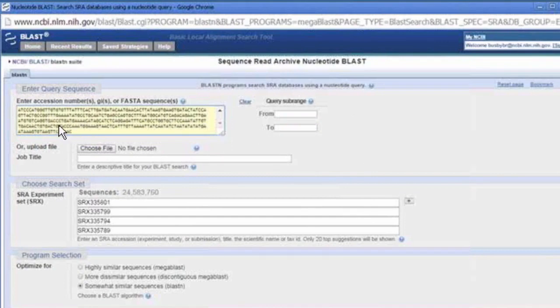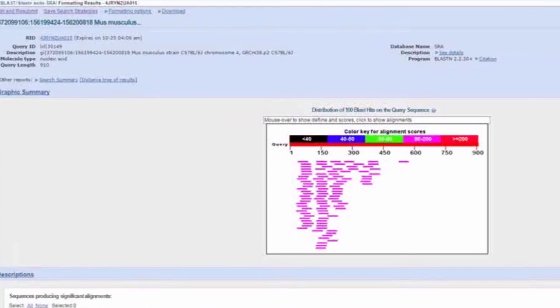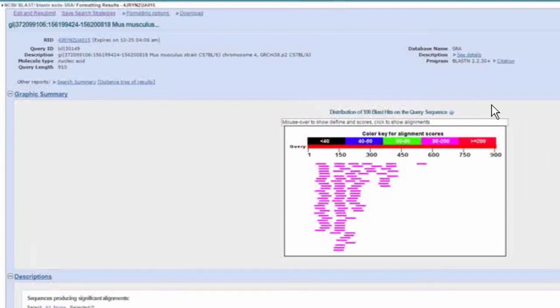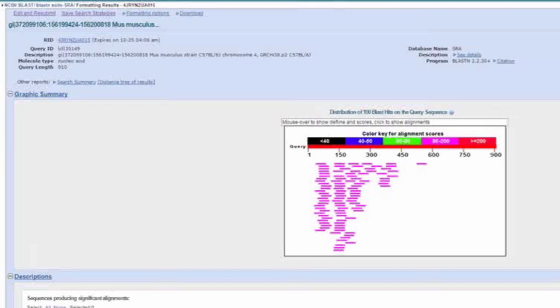So once again, using the Send To module, selecting BLAST and pressing SID. This will open up a normal BLAST page. And in a GUI way, you can paste in your sequence, and it will have the SRA records by default. Hit BLAST, and in a couple of minutes, you'll be able to see whether or not your particular gene of interest is represented, or well represented in that data set. For those of you who are a bit more technically savvy, BLAST and VDB is available on the command line and can do many of the same things.